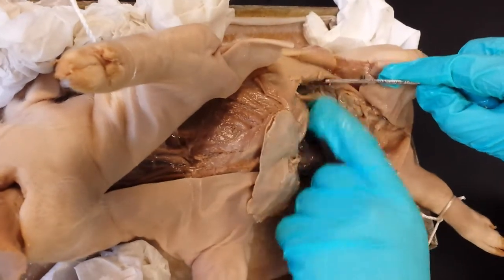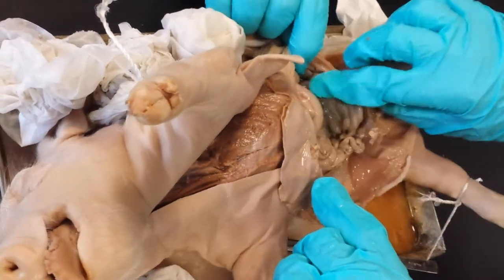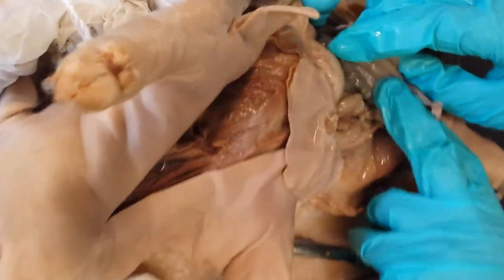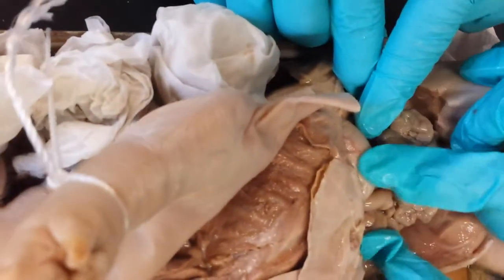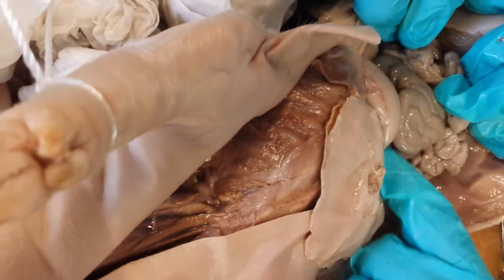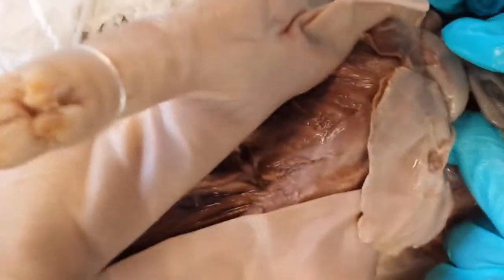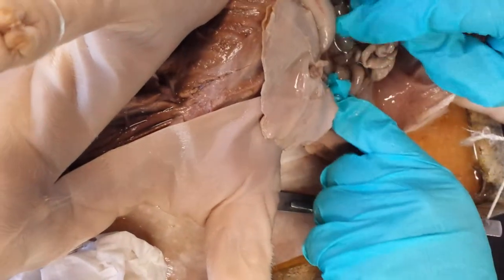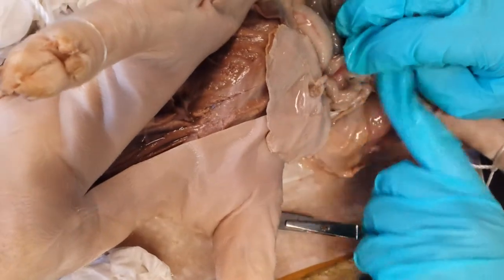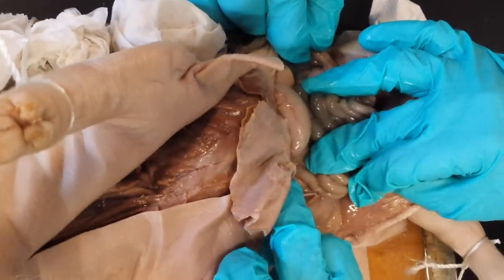Oh, there's a thing behind here. It's kind of darker. I think it's separate. Is that the spleen or the pancreas? I'm not sure, but it's purple and oiled up. The spleen. That's an intestine. Yeah, all the coils. So is this the small one? That's the big one? The small one is coiled, thin, and tube-like. All of these are tube-like. Okay, fine. And the big one is thick. Thick and tube-like as well? Okay, so this is the large. Yeah, you were right. Sorry, Alex. You're a genius. And I think I see where it connects. Do you guys see the rectum? Here, pull out the intestines. I think I see where it connects, all the way down there.